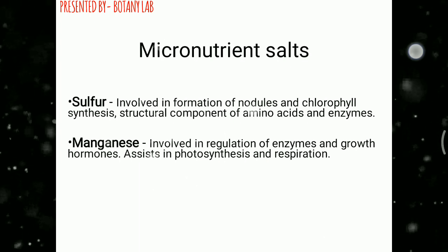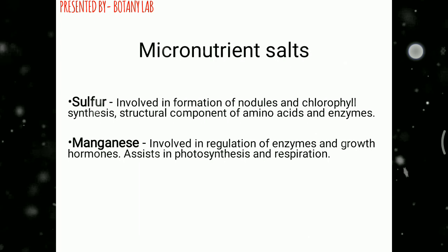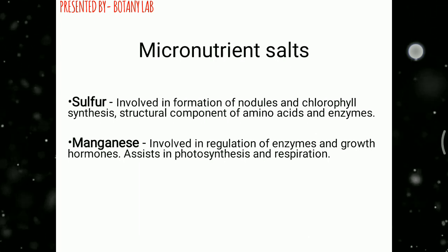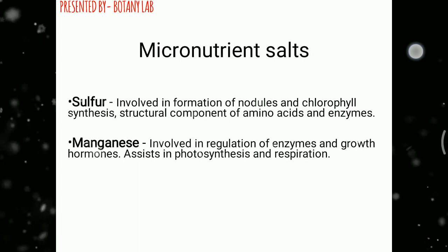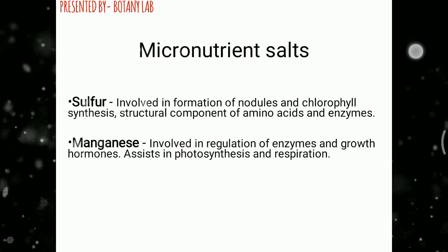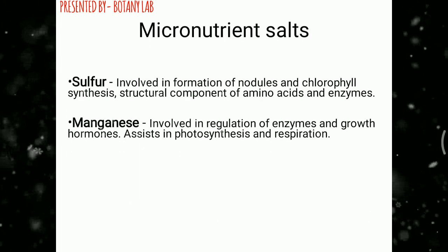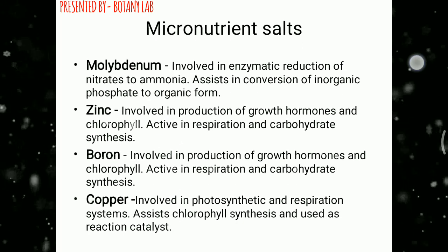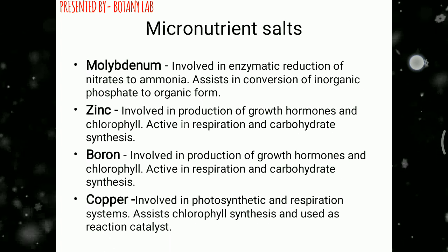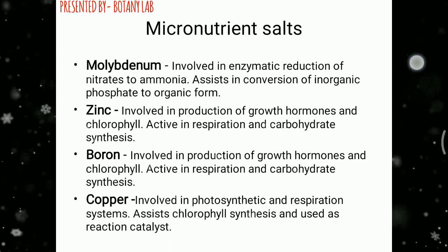And now micronutrient salts. Sulfur is involved in the formation of nodules and chlorophyll synthesis, a structural component of amino acid and enzyme. Manganese is involved in regulation of enzymes and growth hormones, assisting in photosynthesis and respiration. Molybdenum is involved in enzymatic reduction of the nitrates to ammonia, and assists in conversion of inorganic phosphate to organic form.